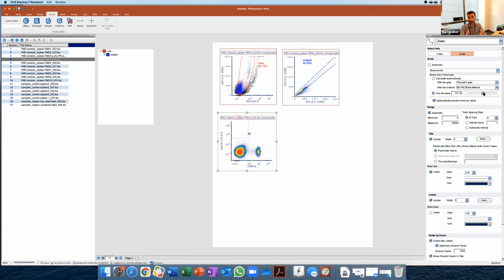But you can always play around with the scaling and get more accustomed. But it's not crucial. So the way it was, I would be okay with it. It doesn't really matter; for me at least, it doesn't really help that much. But some people find it much more comfortable. Oops. So I can go again and do it like this, right? But from data to data, a different scaling might be more interesting.